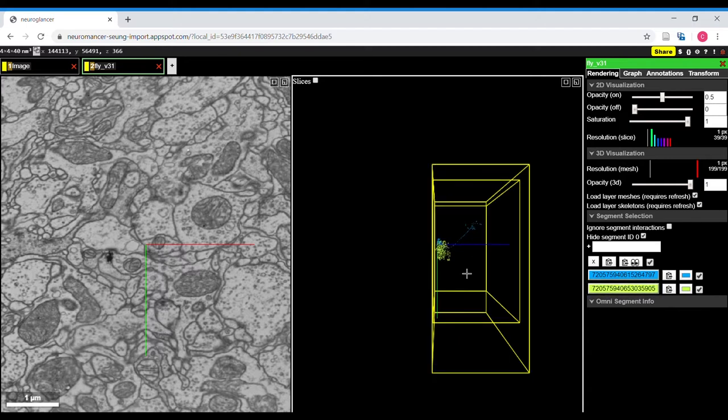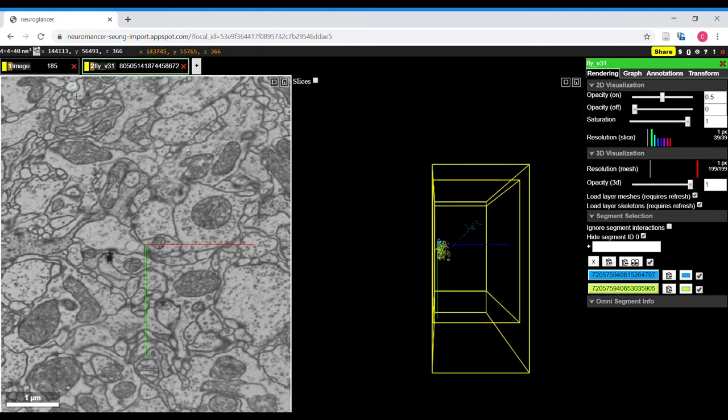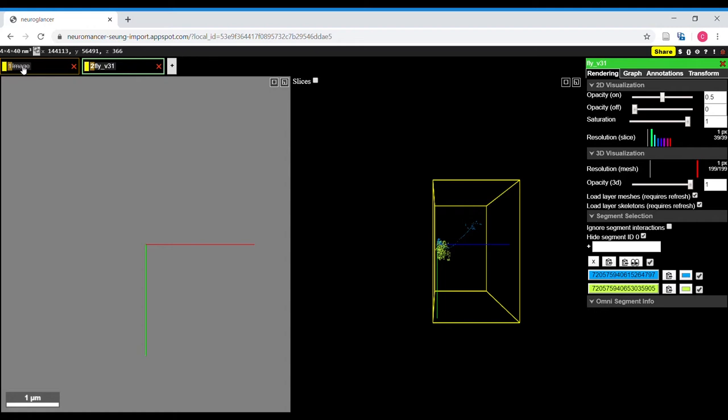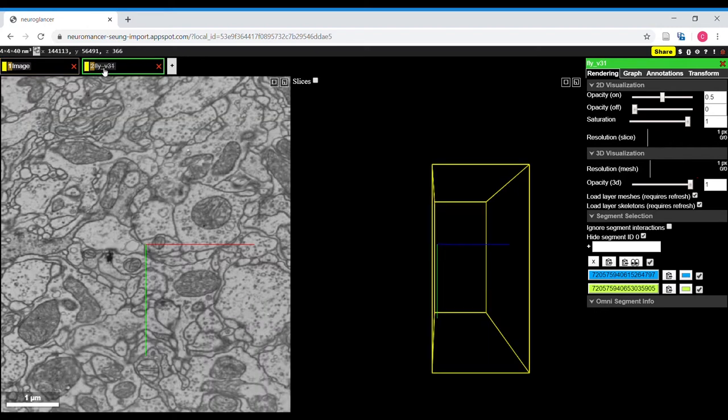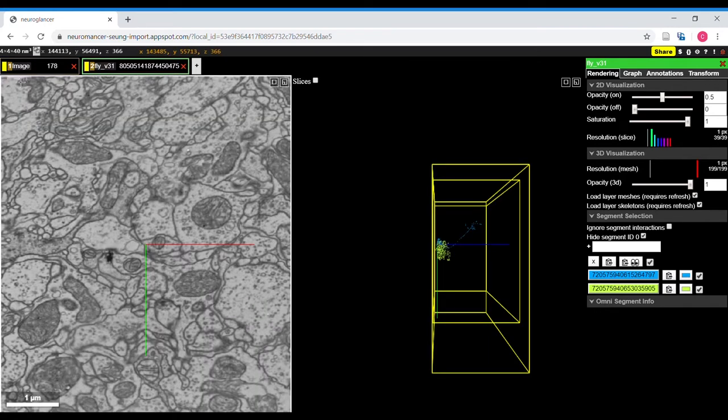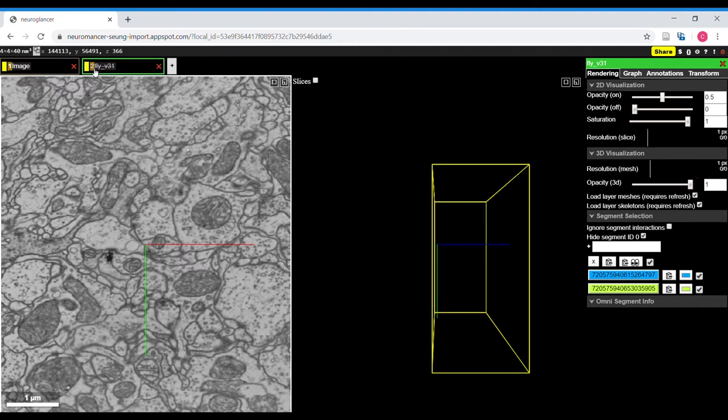You can left click to hide a tab or click on the number that's located beside it. So if I hit number 2 on my keyboard that would hide this tab.